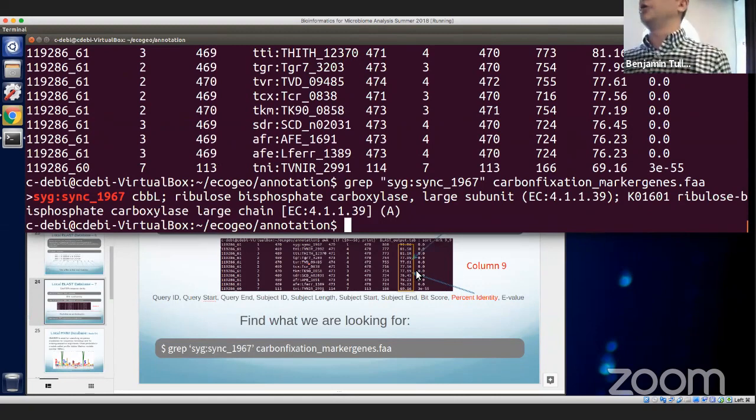You submit your genomes to IMG and it takes 3 weeks to process, or you submit your data to MG-RAST and it takes 3 weeks to process. This is a good way of trying to get an answer, and a high confidence answer. So even when you get a result back from IMG or MG-RAST, you can then use these smaller curated databases to be sure that the results you're getting back are real.